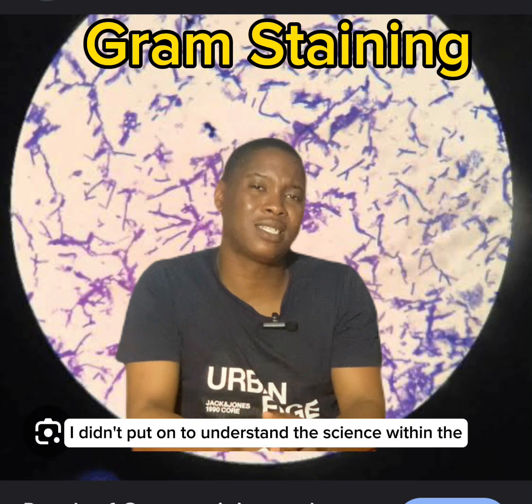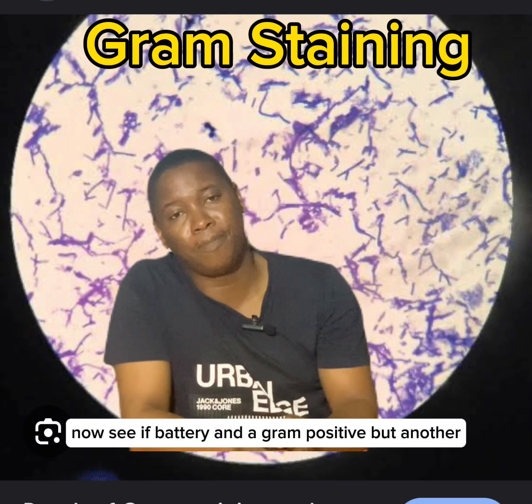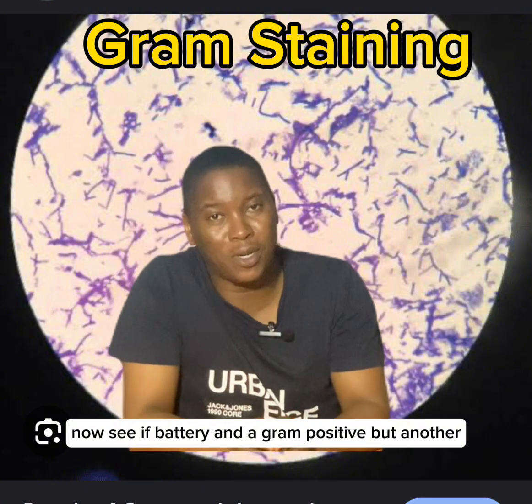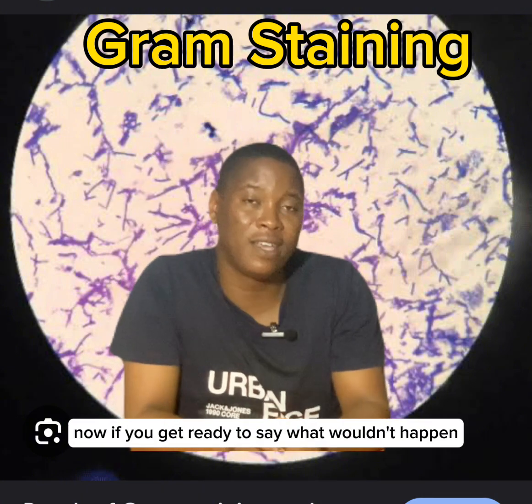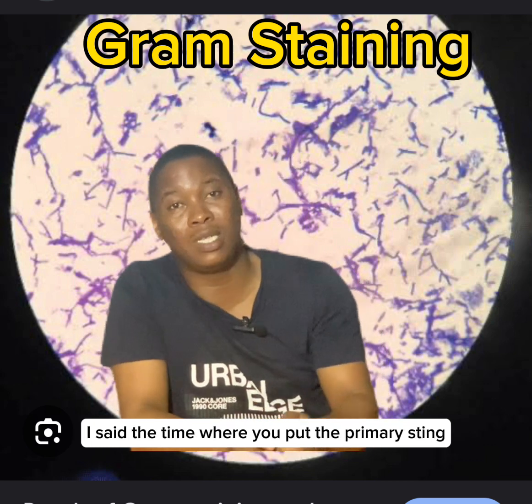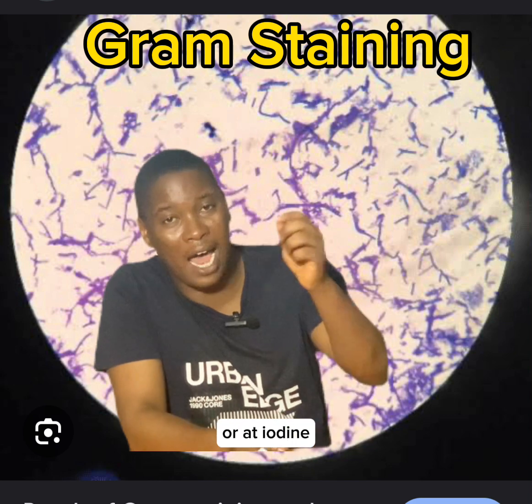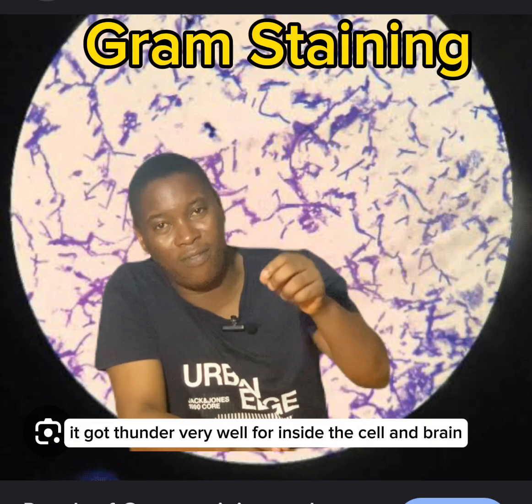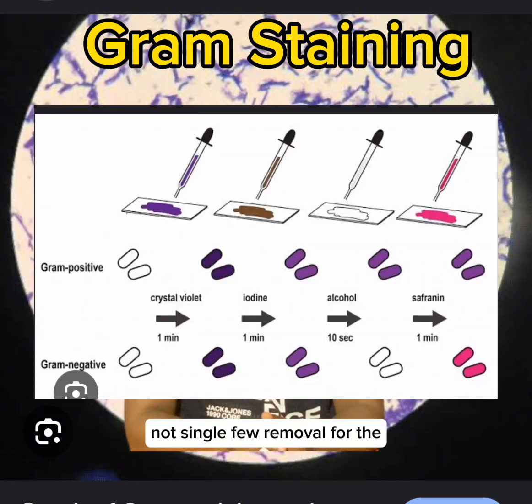Now, e dey important to understand the science, wetin dey actually happen for this place. Now, wetin dey happen na say if bacteria na gram positive bacteria, that bacteria go get very thick cell wall. Now, if you get very thick cell wall, wetin go happen na say the time wey you put that primary stain wey be crystal violet come add iodine, e go tanda very well for inside the cell wall. Nothing go fit remove am for there.